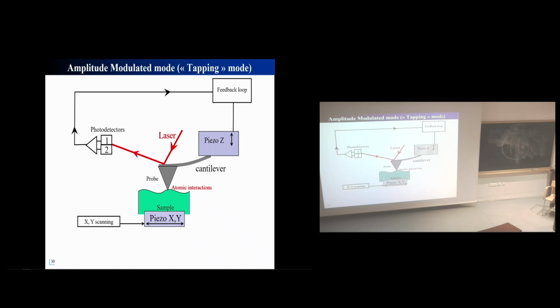Then is it possible to stabilize a situation in which the tip is not actually in contact with the surface, but is just hovering above? Yes, it is possible. This is used in what is called non-contact AFM mode, something really advanced to obtain atomic resolution with an AFM. We can discuss that afterward if you want. But in a regular commercial AFM, if you use the attractive mode, in fact, it's extremely unstable because, as you see, there are two attractive forces.